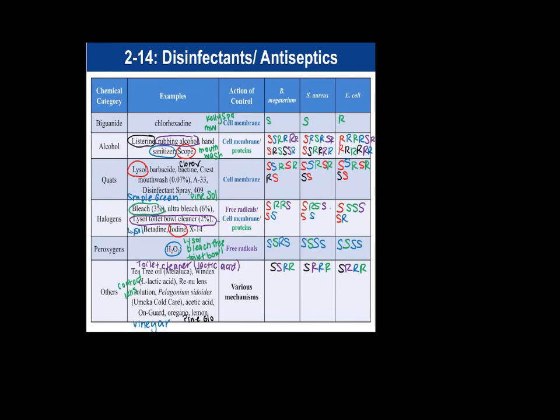and acetic acid is used in the organic industry as an alternative disinfectant antiseptic for treatment of food products, and to get that label organic, you can use organic acetic acid. Now, vinegar is, I believe, 3% acetic acid, so it's a little bit lower content acetic acid than what they use in the industry. I tend to suggest using vinegar if you're opposed to bleach, but just understand vinegar isn't as effective against certain types of organisms.